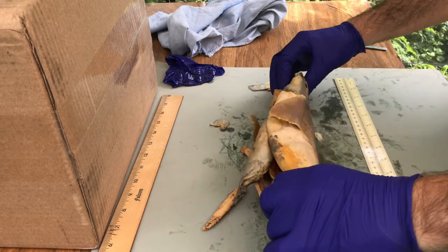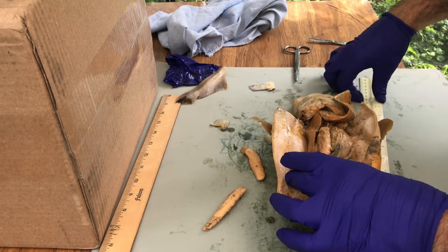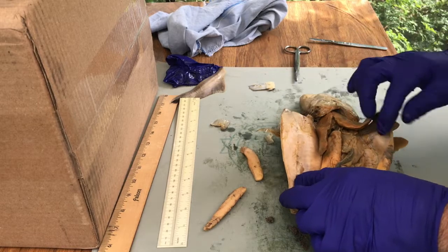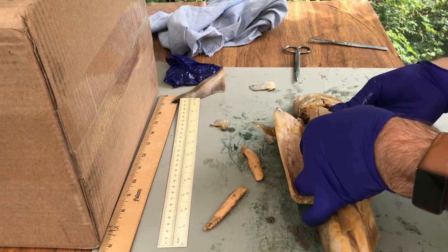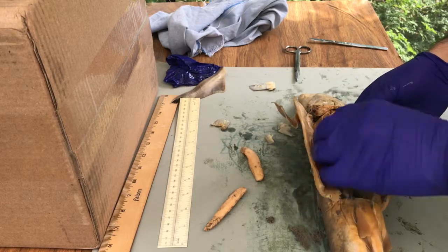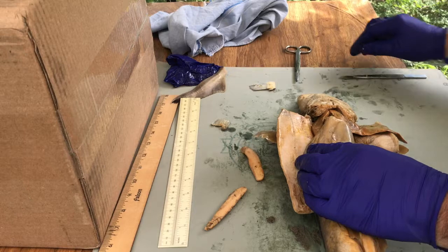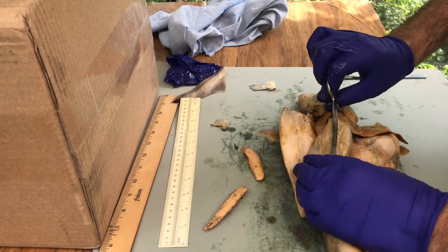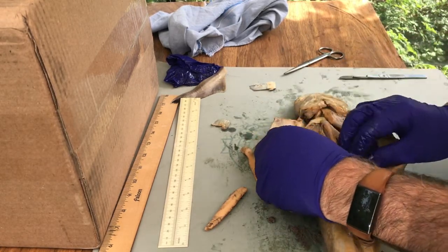So I did want to open up the stomach of this guy and see what the prey item was there. Let's move that ruler out of the way. And the liver there, the intestine, and the stomach here. Definitely something in there. Feels very fishy to me. Maybe there's two things. I'm going to make just a tiny incision right there and then cut down a little bit, open it up, and look at that, look at that.